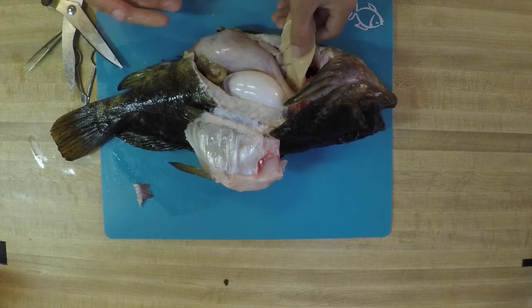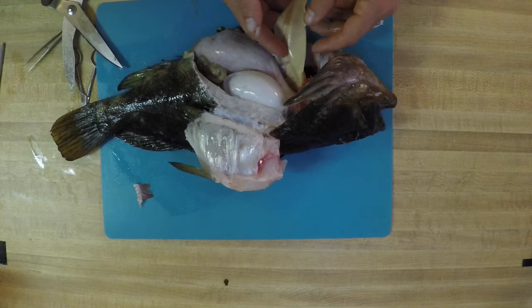The swim bladder can also be known as a gas bladder — those are synonymous with each other. This is our part of our liver. They have a three-lobe liver. Livers are a very vital organ for lots of different creatures. Livers are actually part of the blood filtration — they help make sure that fish is very healthy and has very clean blood going through the body. The same thing happens in humans too — our livers help to clean out our blood system and keep us very healthy.